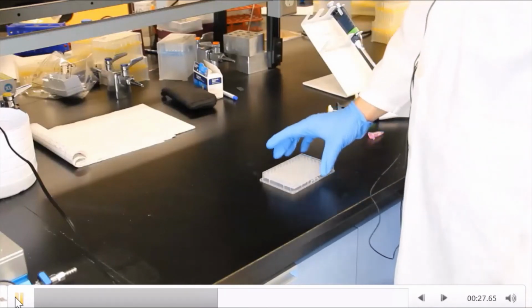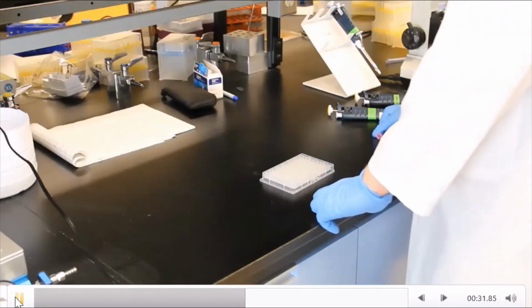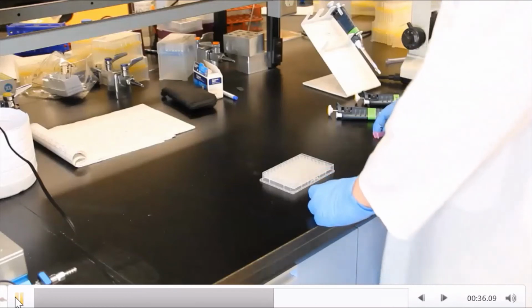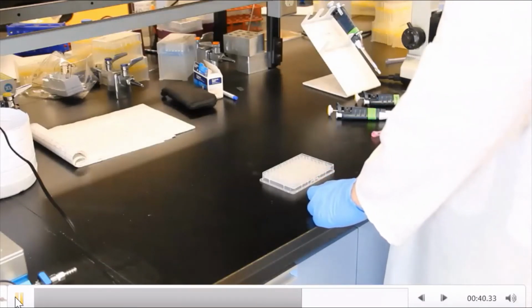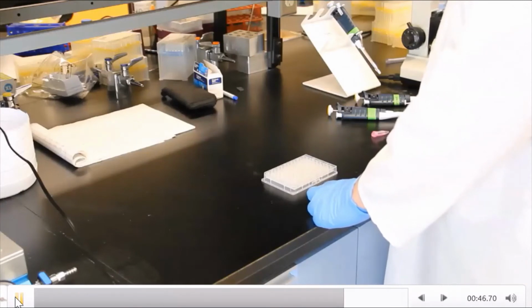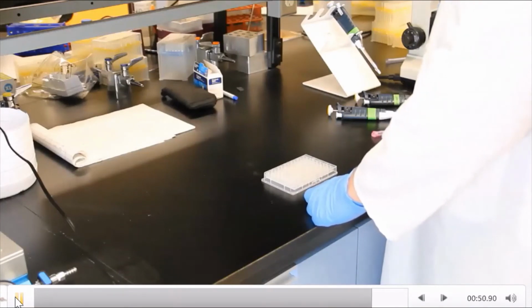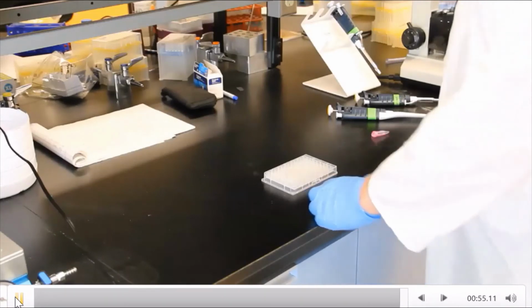In our plate here, to be read, we have 3 replicates of our positive infection control, 3 replicates of our negative infection control, and the standard curve using the same standards that we made up for our glucose measurements using the glucometer. All the other wells are filled with infected red blood cells with a known glucose concentration that we will be adding a new therapeutic agent to and testing for the new glucose concentration that we see in the wells.